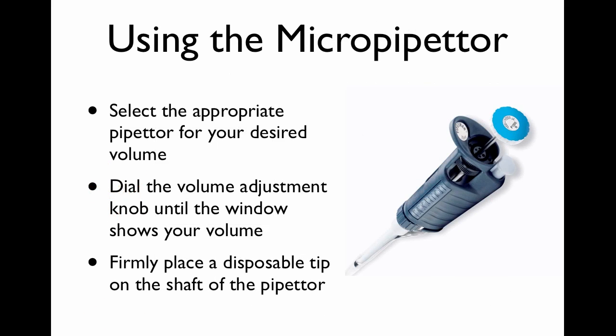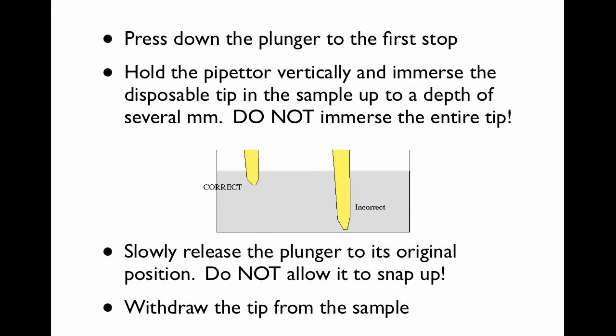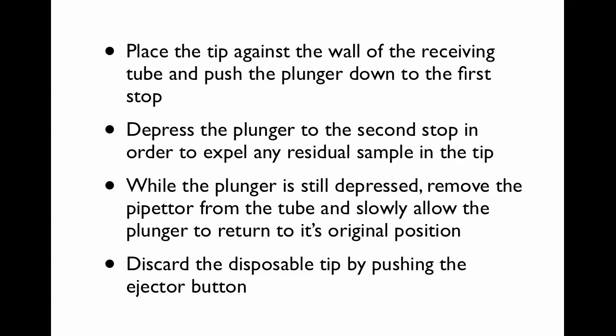To use the micropipetter, first of all, you've got to pick the right one. You've got to dial in the correct volume and then you've got to firmly place your tip on the end of the pipetter. And you're going to press the plunger down to the first stop. And then you're going to hold it vertically and immerse it a couple millimeters into your fluid. Don't go all the way to the bottom. You're going to slowly release the plunger. Do not allow it to snap. So, you want to do it in a controlled fashion. Snapping will change the volume that you're actually going to get. It will reduce your accuracy dramatically. And you're going to withdraw the tip.